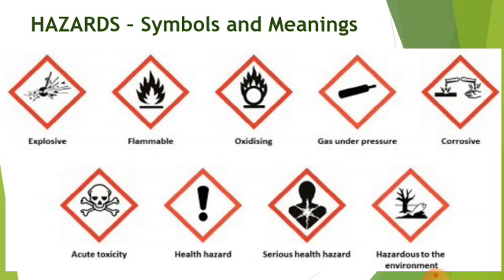Hazards, symbols and meanings. These symbols are internationally accepted all over the world. We are starting from the left side. Explosive. This symbol might be written on any chemical, meaning it can explode, so we should not touch that without any use.